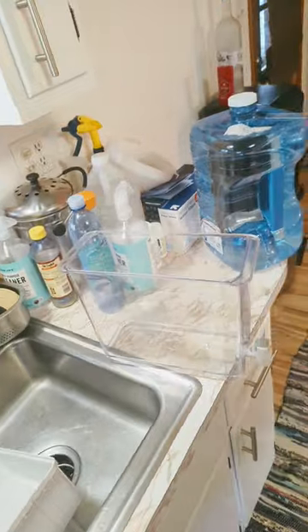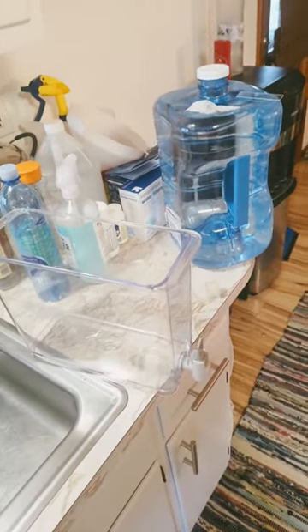This is part two of my video checking spring water for microbes. In part one I did find something moving on the non-filtered side of my Brita filter. Now we're gonna check the debris on the filtered side.